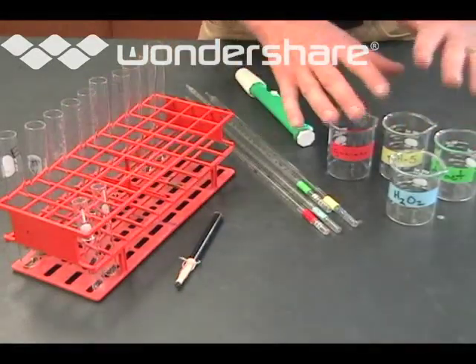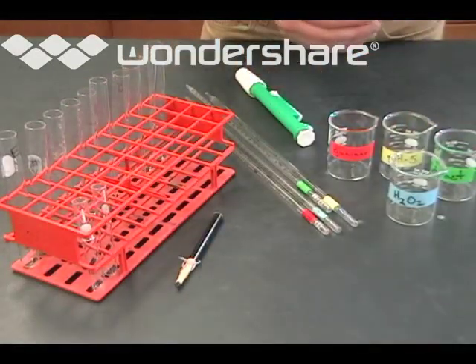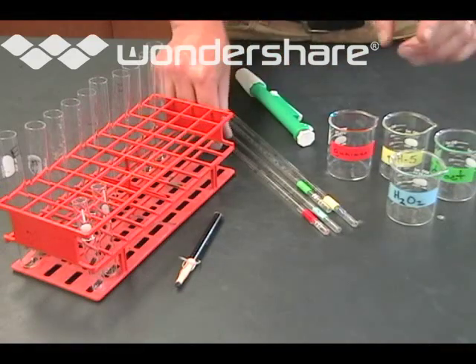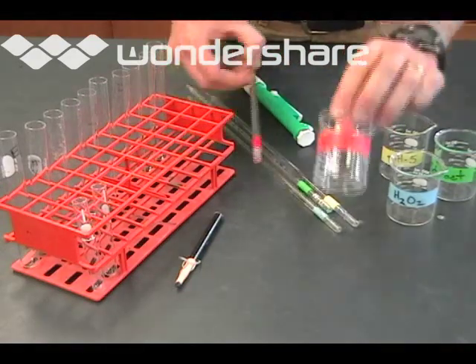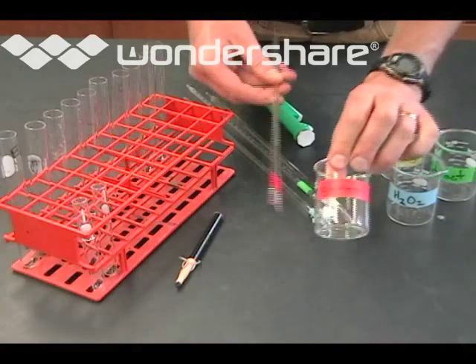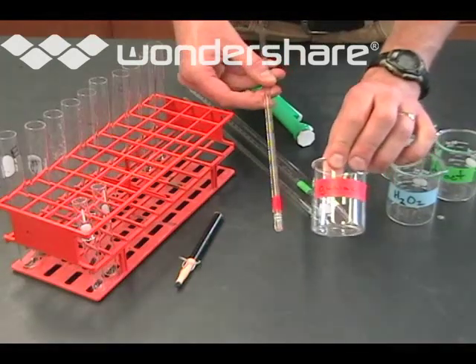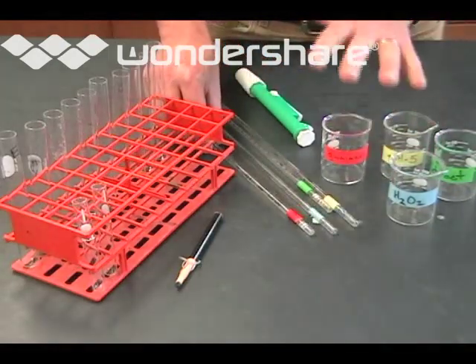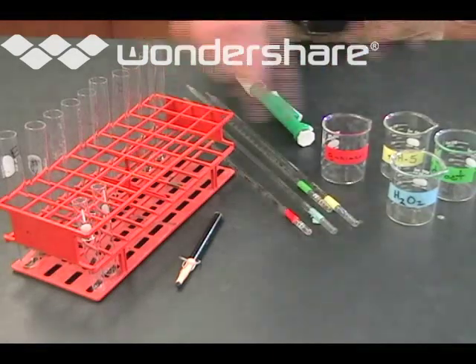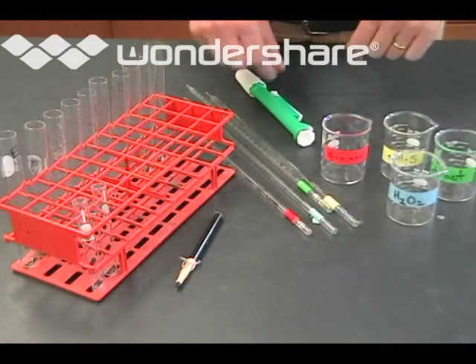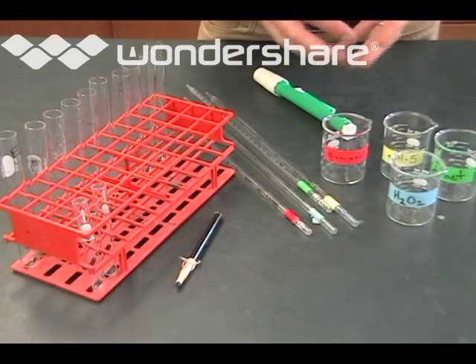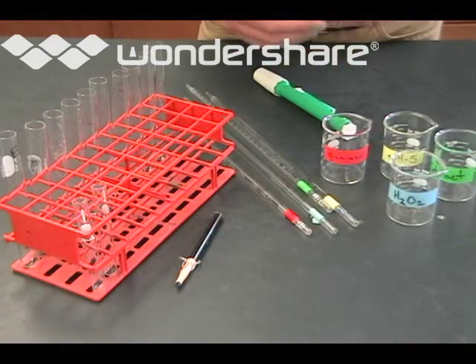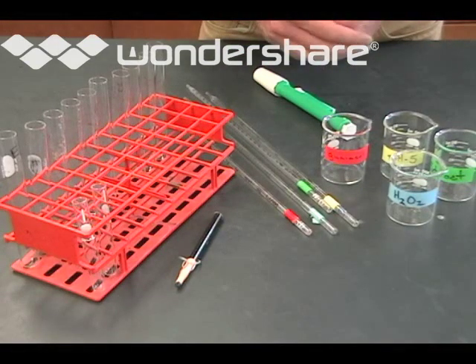These beakers over here are what you're going to use to get the reagents that you'll be using in the reaction. The most important thing to notice here is the color coding. Each one of these has a color, and they each have a matching pipette that has the same color tape on. You have to pay close attention to the colors to make sure that you're not contaminating one solution with the other, because if you get a little bit of the enzyme mixed in with some of the reactants, then your reaction is going to start before you're ready to look at it.